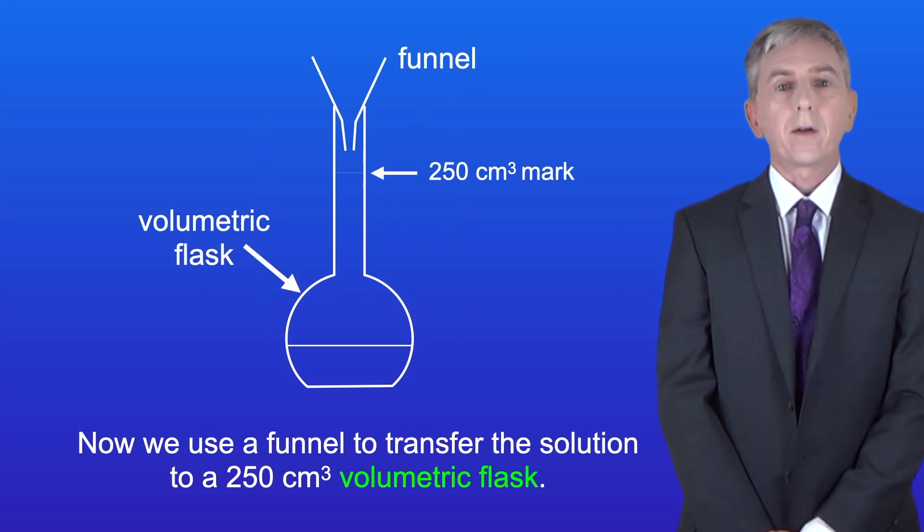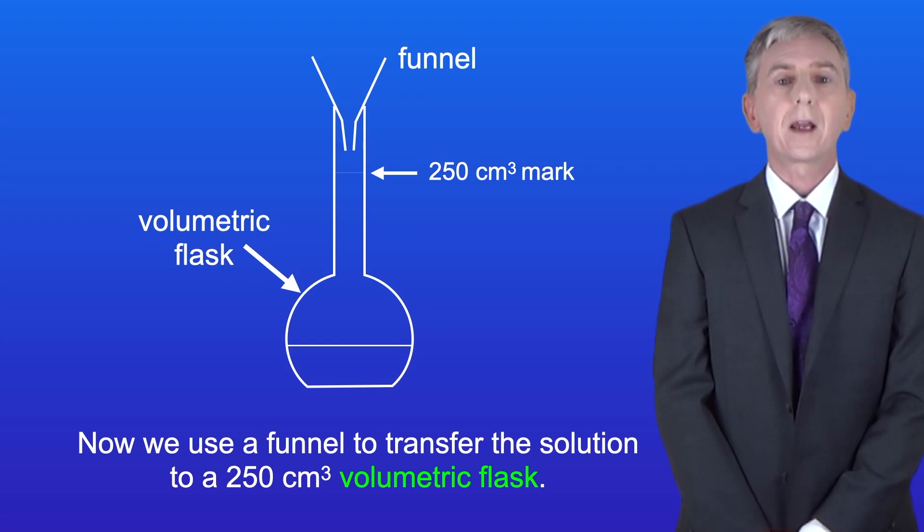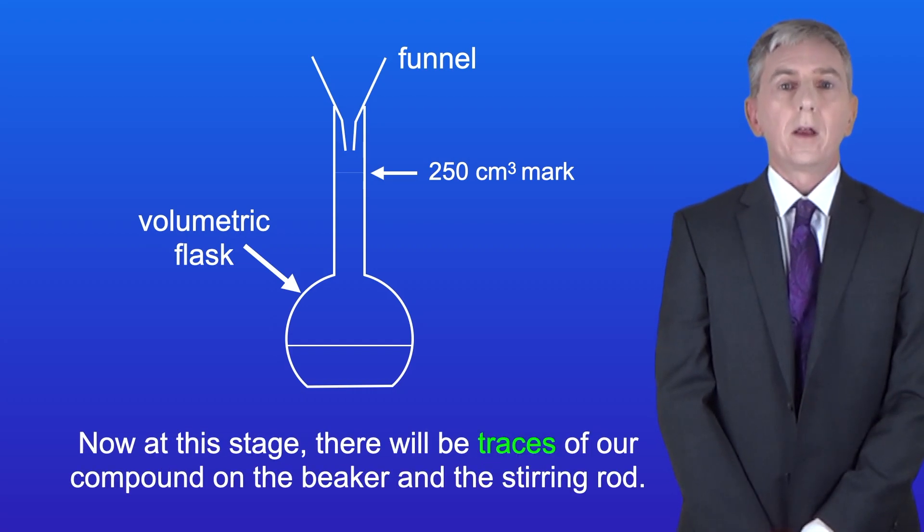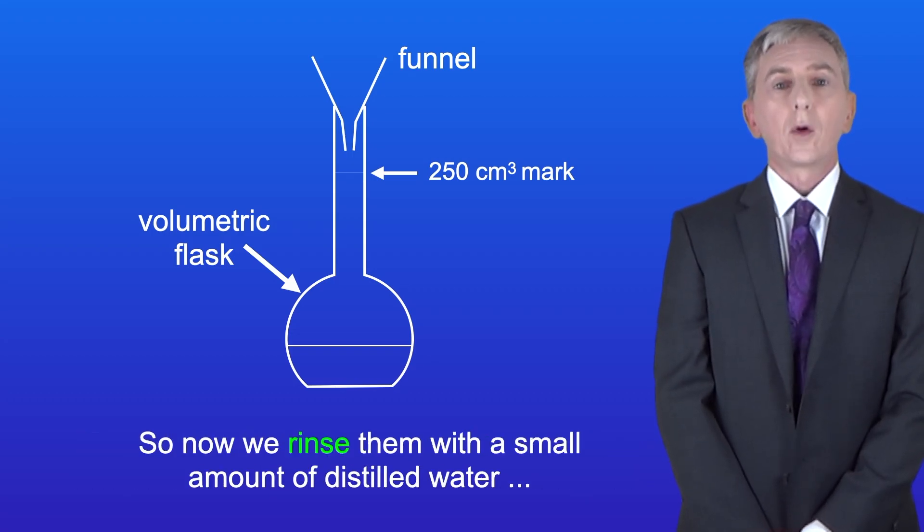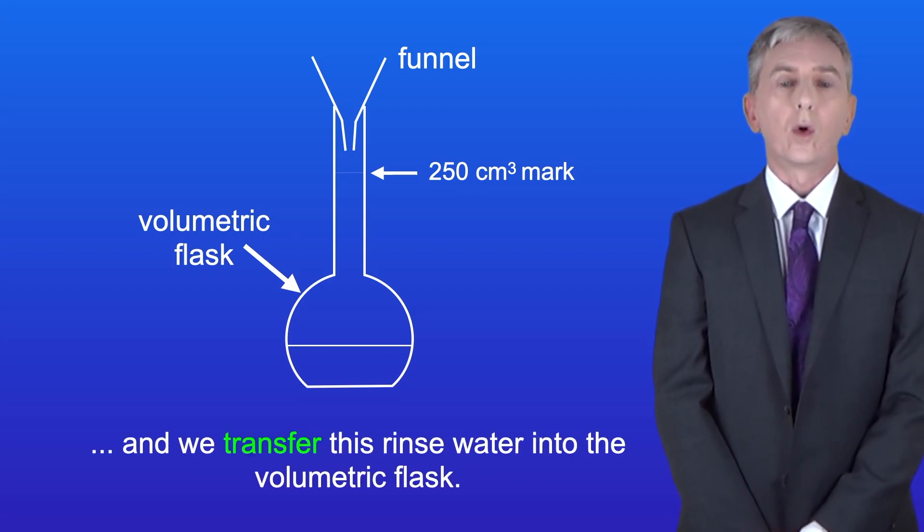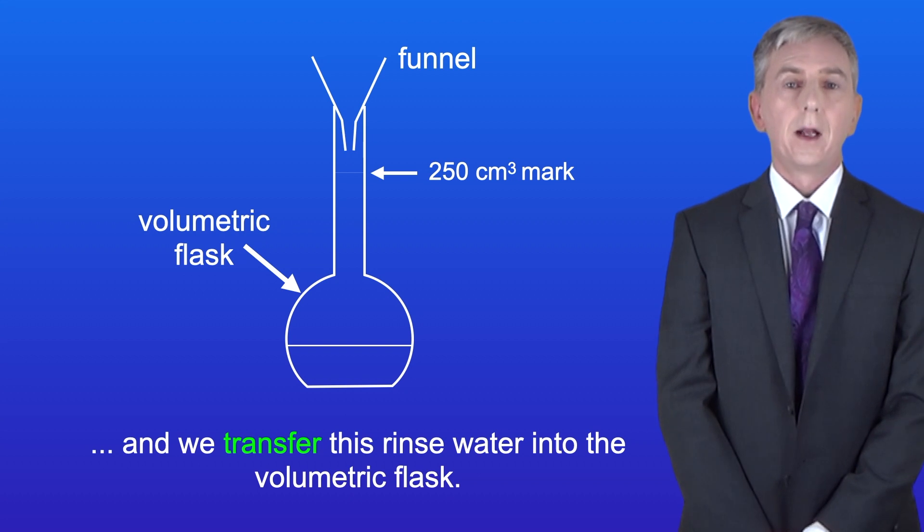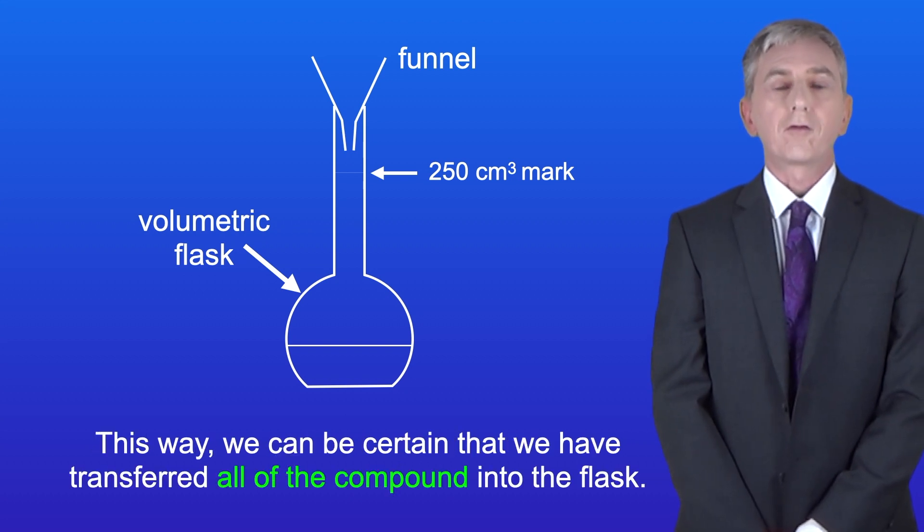Now we use a funnel to transfer the solution to a 250 centimeters cubed volumetric flask. Now at this stage, there'll be traces of our compound on the beaker and the stirring rod. So now we rinse them with a small amount of distilled water, and we transfer this rinse water into the volumetric flask. This way, we can be certain that we've transferred all of the compound into the flask.